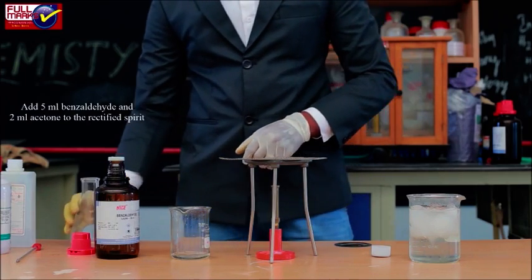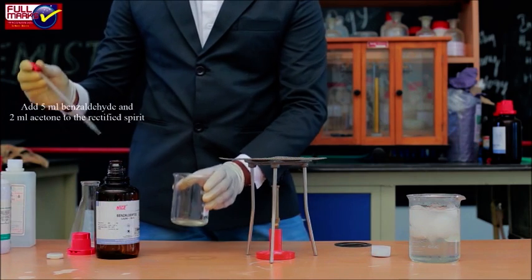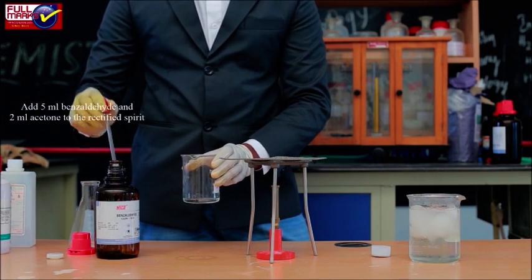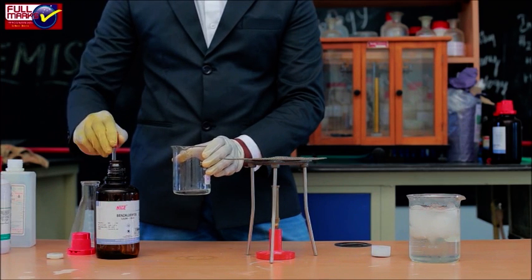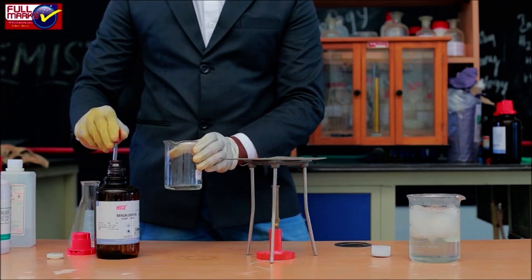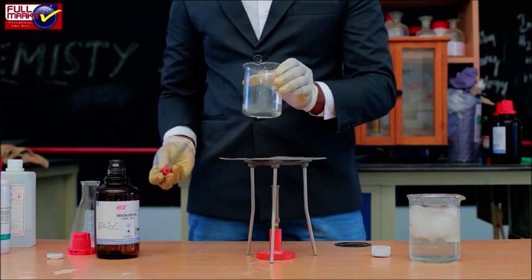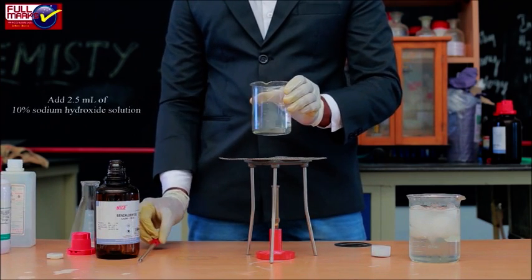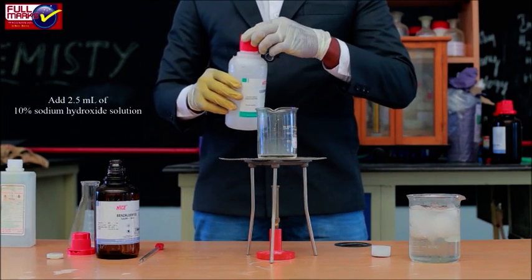Add 5 ml benzaldehyde and 2 ml acetone to the rectified spirit. Cork the flask and shake it to get a clear solution. Now add 2.5 ml of 10% sodium hydroxide.